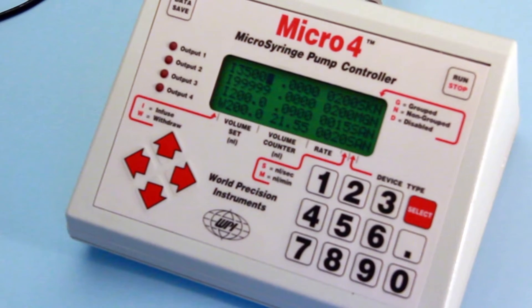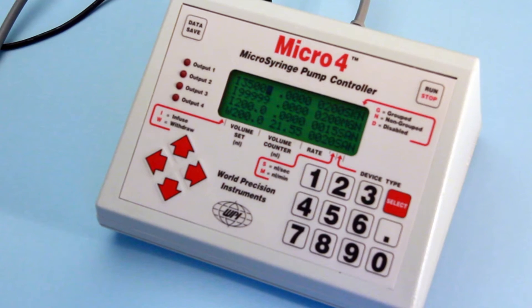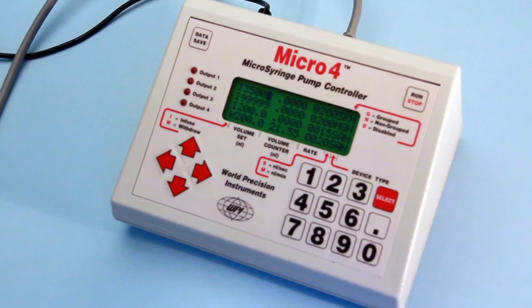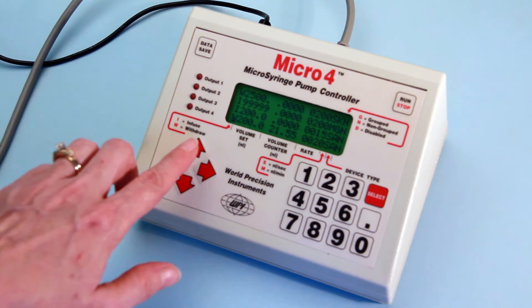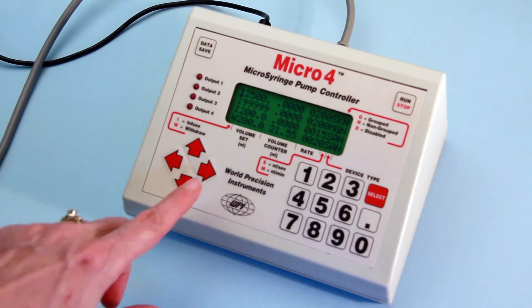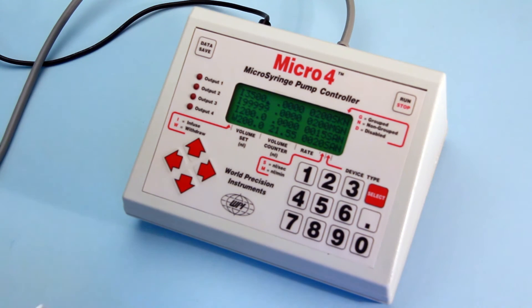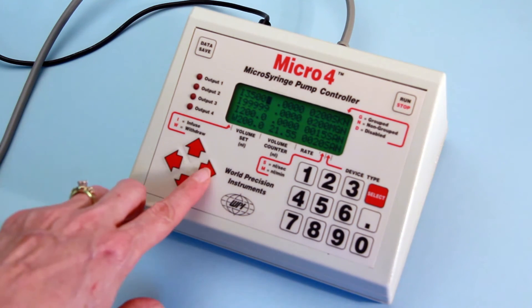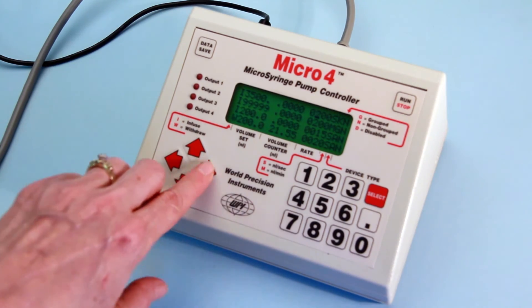An optional microprocessor-based controller, Micro 4, can provide an intelligent and easy-to-use interface for up to 4 nanoliter injectors. Operating parameters are set with the keypad and LCD display. From the keypad, you can set the pump to infusion or withdrawal mode, enter the volume to be infused or withdrawn and rate of delivery, as well as synchronizing the starting and stopping of a combination of injectors.